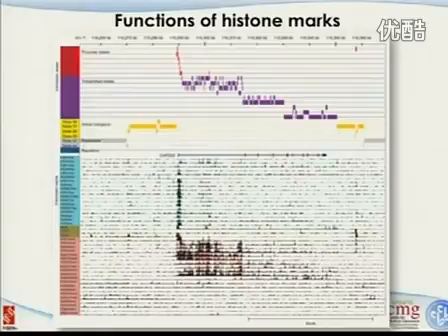And here are the different states, the chromatin states. Let me see. Here it is. These red ones are the promoter states. So you can see that at this promoter region, based on the combination of these signals, these are all the different promoter states. The blue ones are the transcript states. Let me see others. And the yellow ones are the active intergenic regions. So these are different chromatin states.